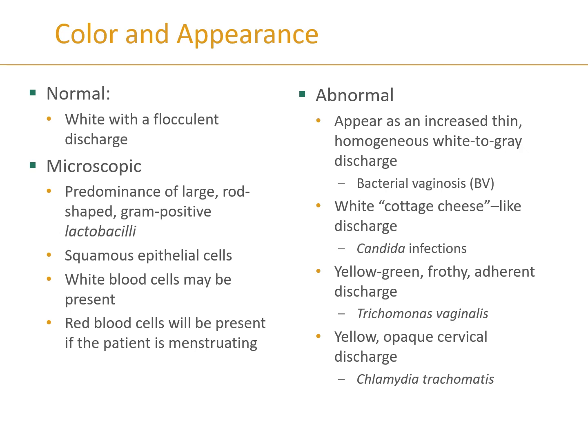With our microscopic examination of normal vaginal fluid, there is a predominance of large rod-shaped organisms. These are gram-positive organisms that are just normal flora, the lactobacilli. You may have heard of lactobacilli when we talk about the bacteria found in some probiotic yogurts. Squamous epithelial cells will be in abundance, just because those are the skin cells that coat the vaginal wall.